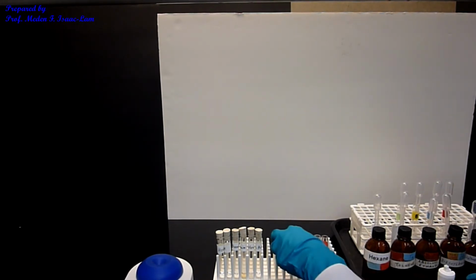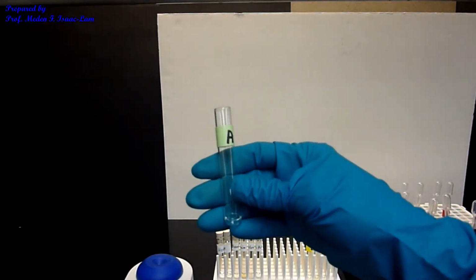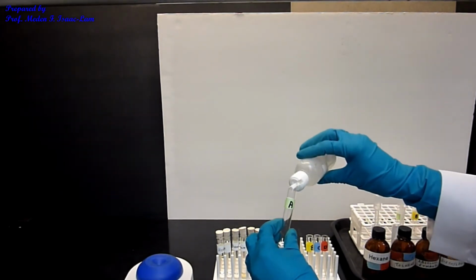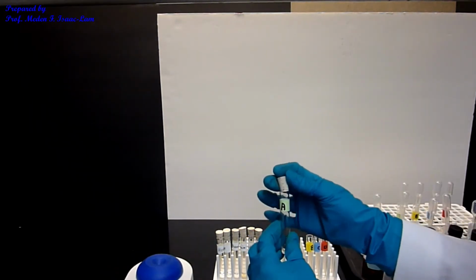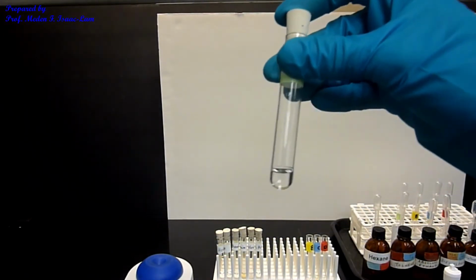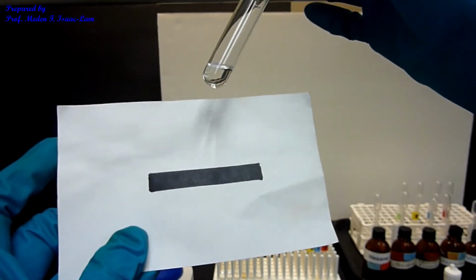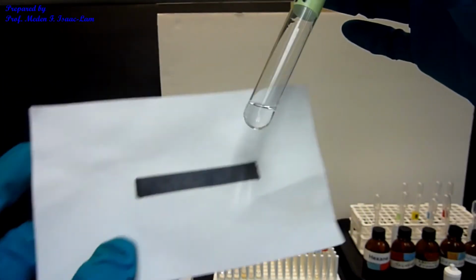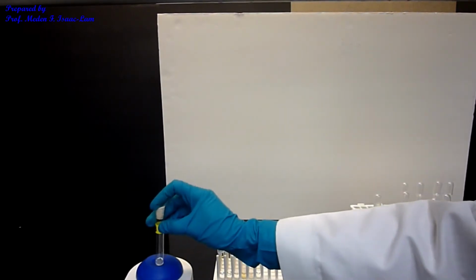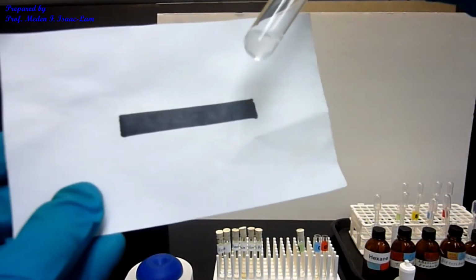Now we're going to do the unknown. So this is now unknown A. And now, so mix it up. So now this is the unknown A. So it mixes. All right. No smoke. So unknown B. Mix it up. So I see some cloudiness.